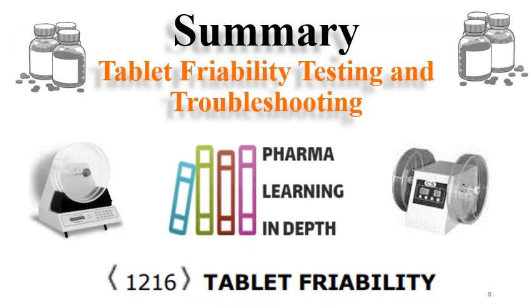It is an in-process test and it is done during the compression run. You should also fix the in-process friability testing frequency like 15 minutes or in between around half an hour, so that you can study the impact of compression process run time on friability. So this is the information regarding friability. I hope I have covered the friability testing and its troubleshooting.